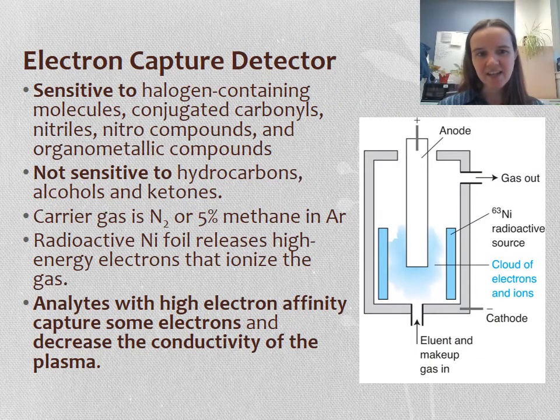For things that contain electronegative species, you have the electron capture detector. We used to have this, and then we got rid of it. And when we got rid of it, we had to get rid of the radioactive source. Super fun getting rid of radioactive material.